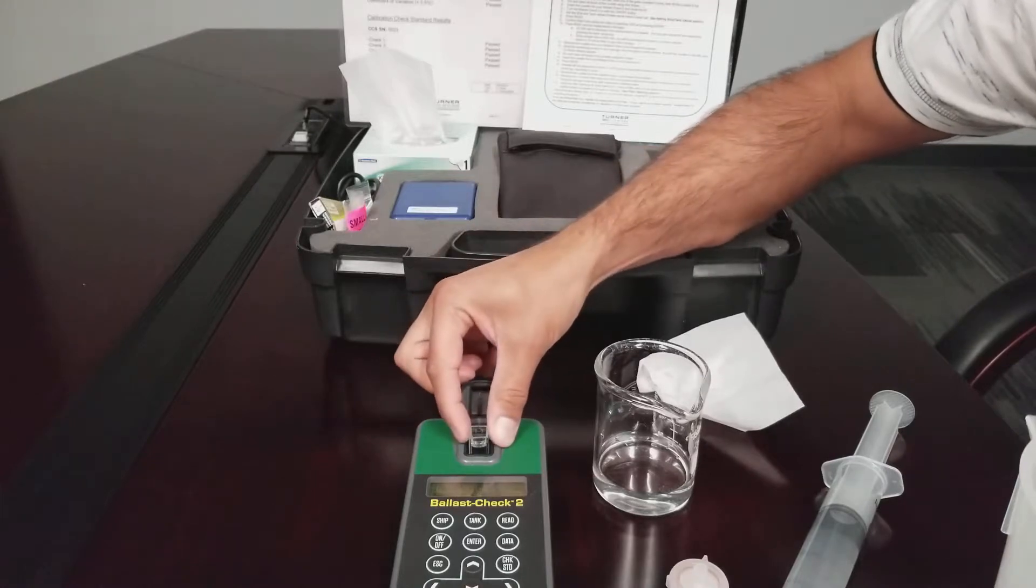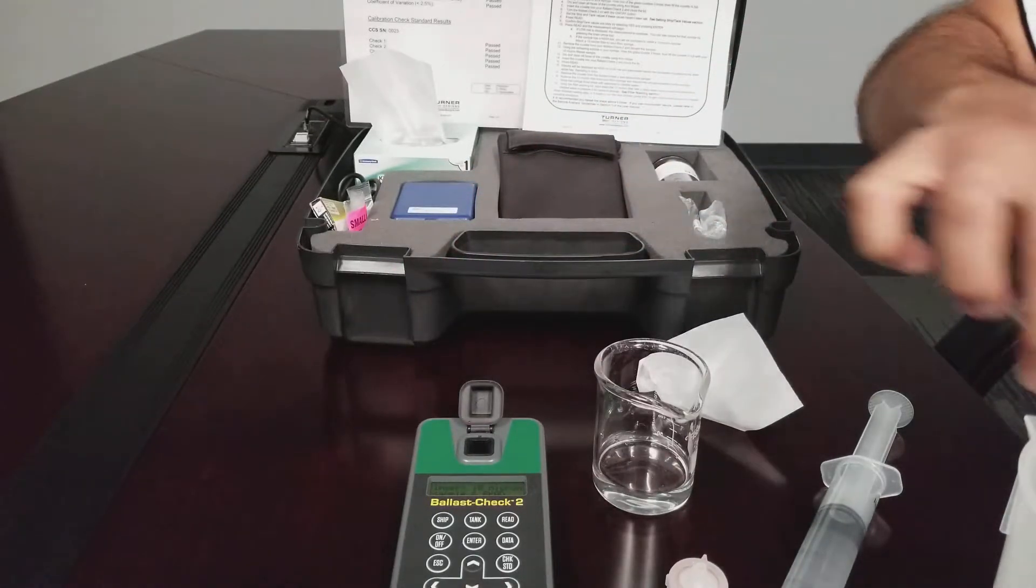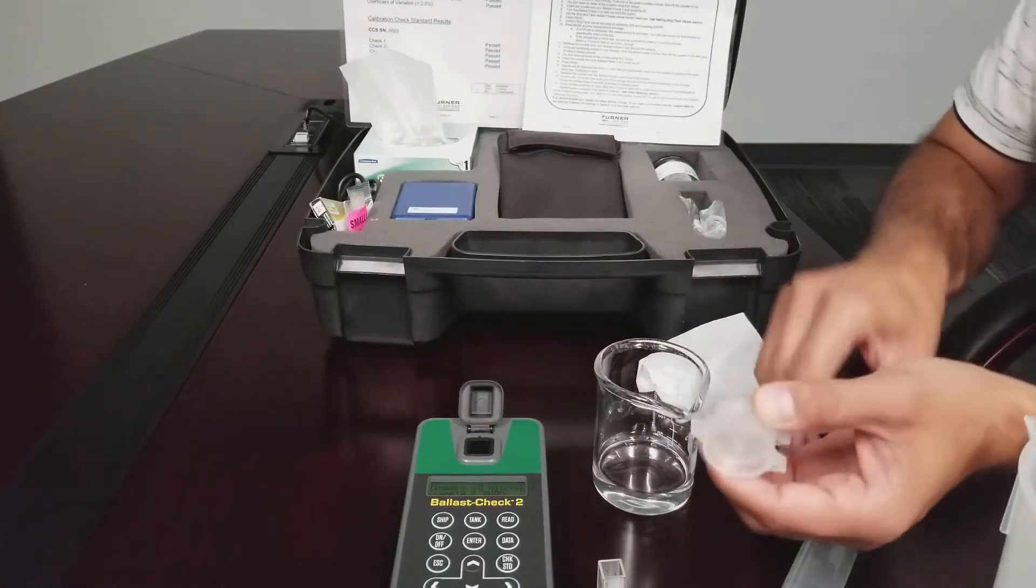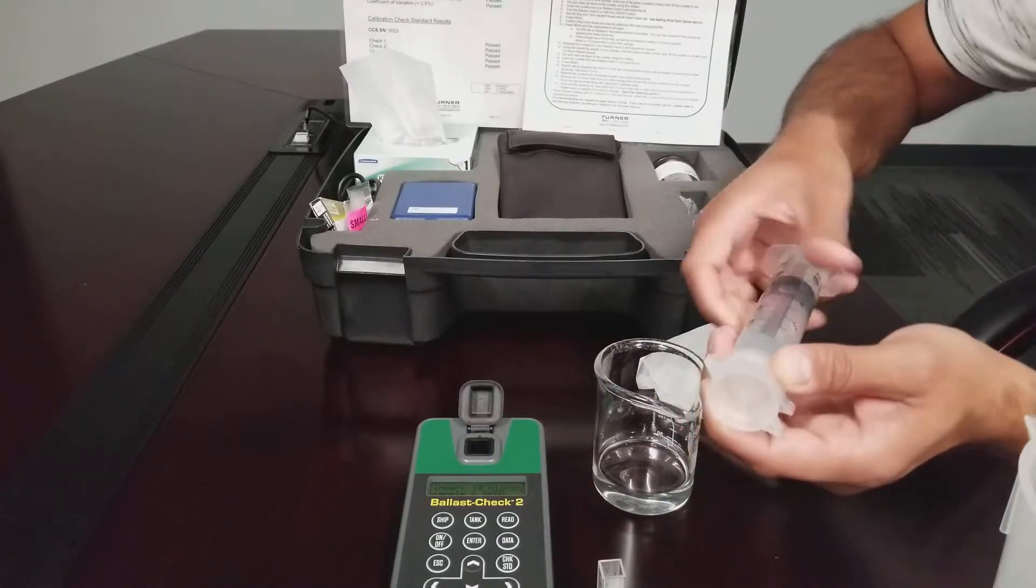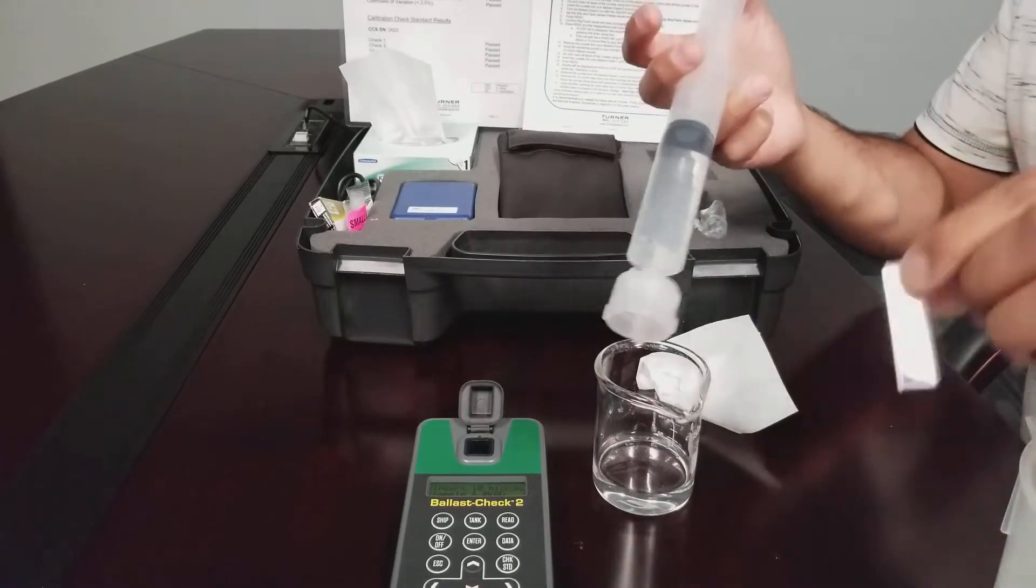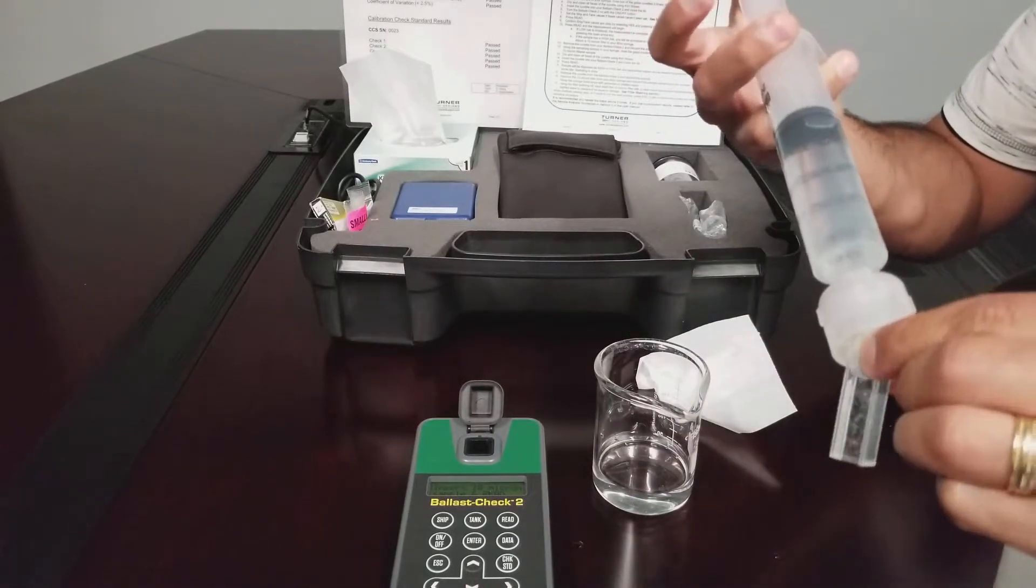Remove the cuvette from the sample compartment and discard the sample. Obtain a 10 micron filter and attach it to the end of the 60 cc syringe, and rinse your cuvette three times with your filtered sample.